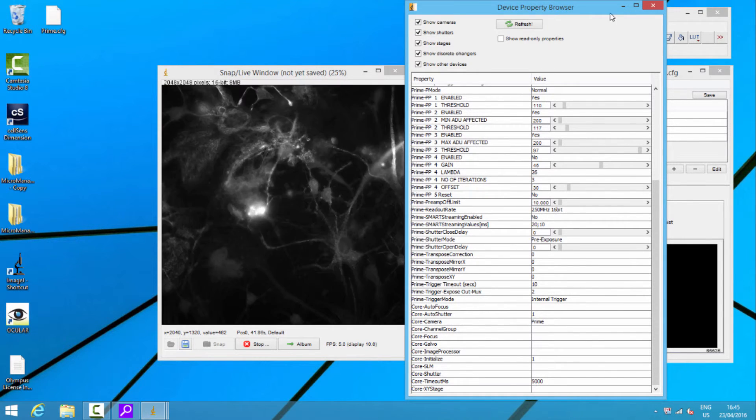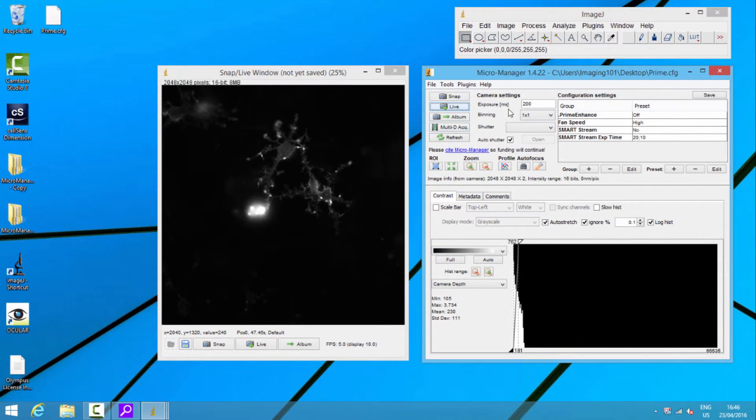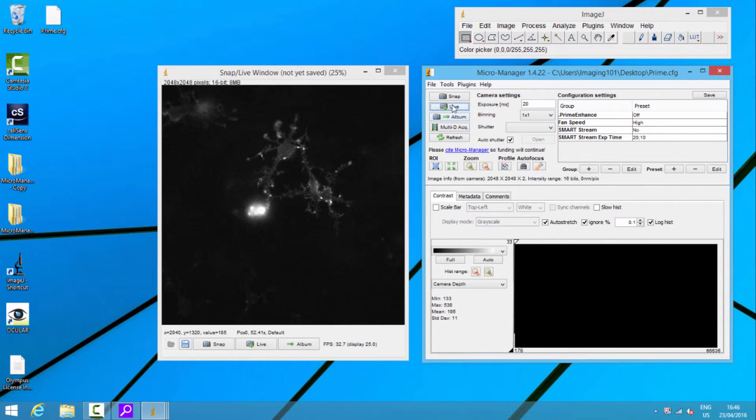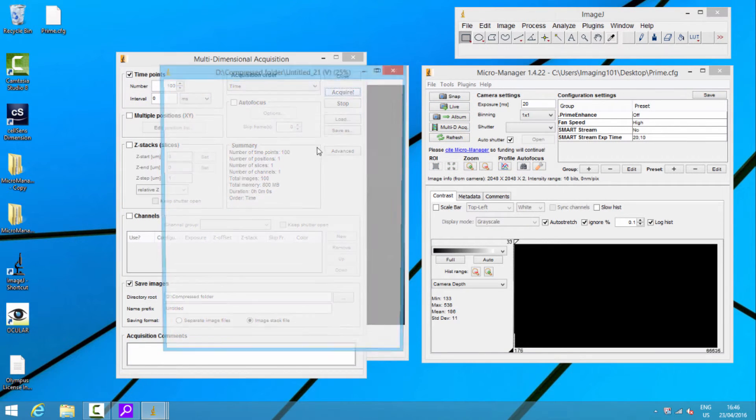We're going to have two triggers out. The minute I do this, you can see me flicking between the two channels automatically — just two BNC connectors going onto the back of an LED light source, going red, green, red, green. If I reduce it and go live, Micromanager is not quite as good at keeping up on showing the live display — it's a pretty hard job.